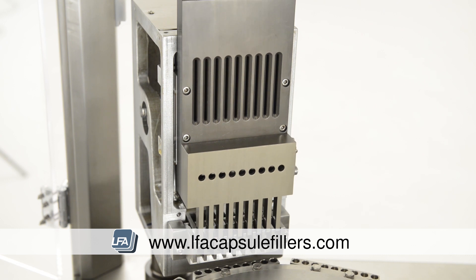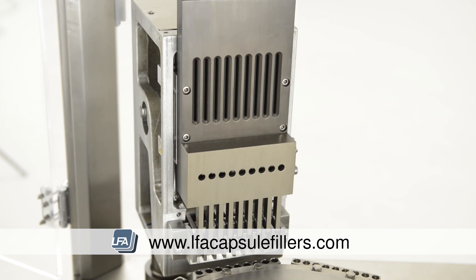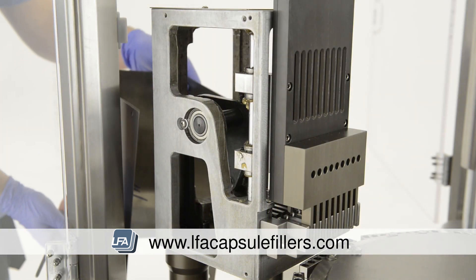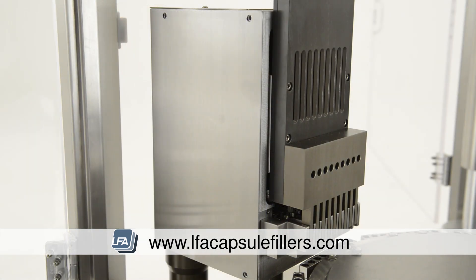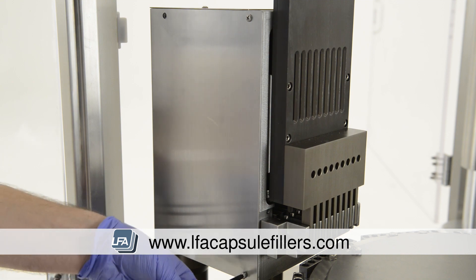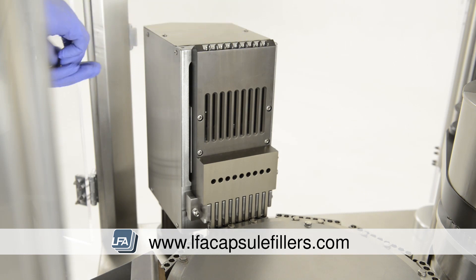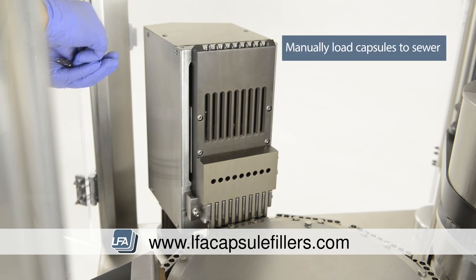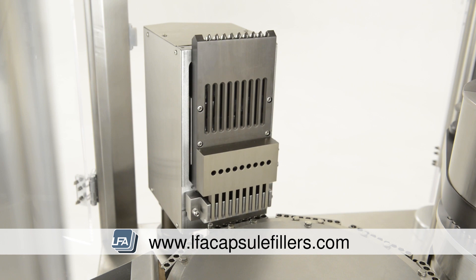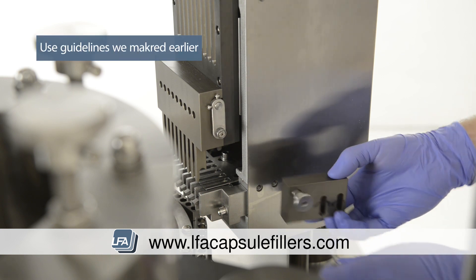Again turn the machine turret by hand and listen for squeaking or rubbing sounds. Now replace the side panels of the capsule sewer and replace the bolts. Before we replace the capsule release pin, we need to add some capsules to the capsule sewer. Take your capsules and manually load them into the top — ensure it's fairly full.